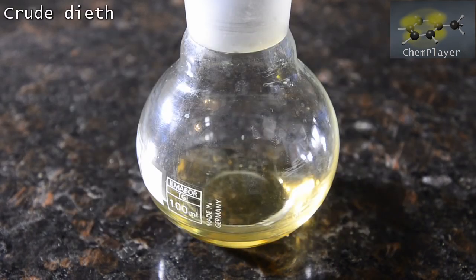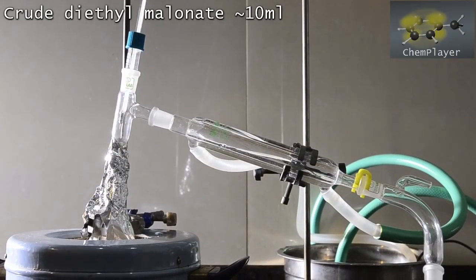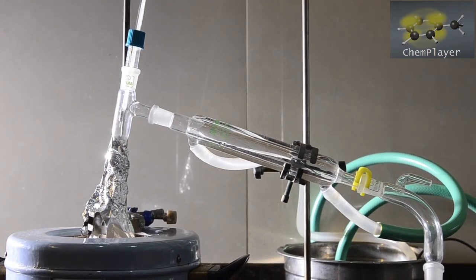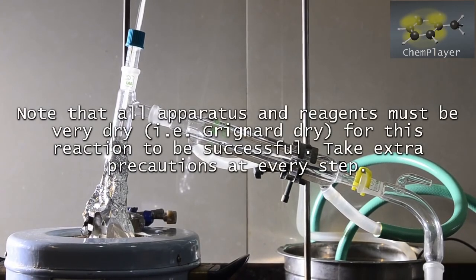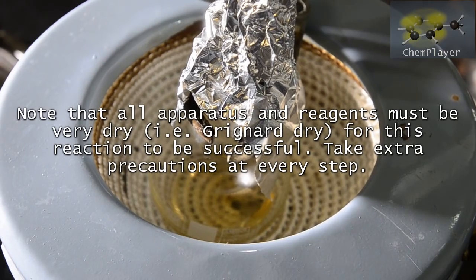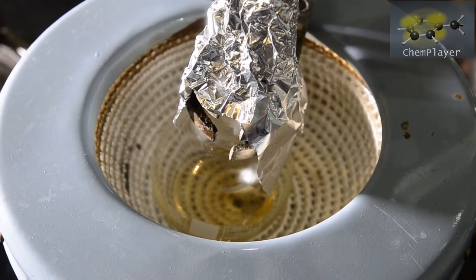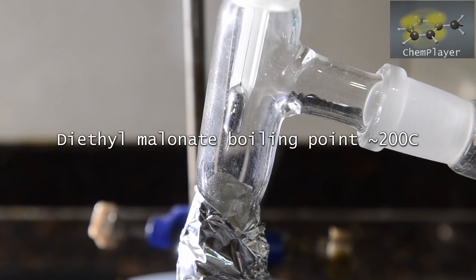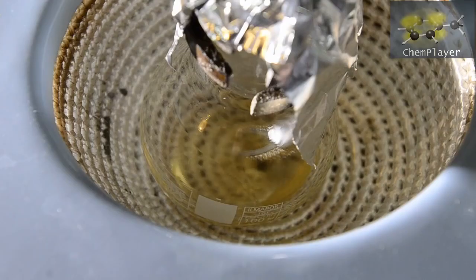First we're going to get it as pure as we can by distilling it. We've got about 10 ml of diethylmalonate here in a small flask, and we've set up for simple distillation. It's really important to use pure reagents for this reaction, as well as being extremely careful to ensure that all reagents and apparatus are dry. We're using the thermometer so we can check the temperature of the vapors and make sure we save only the pure diethylmalonate, which boils at around 200 degrees C.